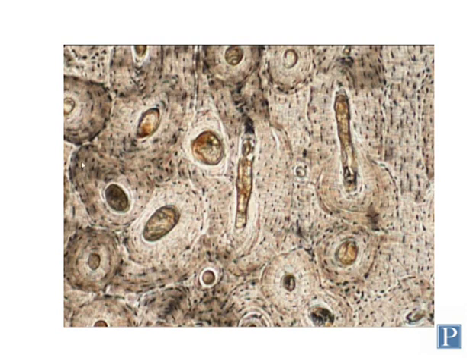Here's another view of compact bone that has been prepared using the ground bone method. Here you can see a Volkmann's canal or perforating canal. Here's another one. Again, these are kind of elongated or cigar shaped as compared to the central canals within the osteons here. Some of them look darker than others, some of them are lighter. On your particular slide, whether they're dark or very light in the center really depends on how that particular slide was prepared.